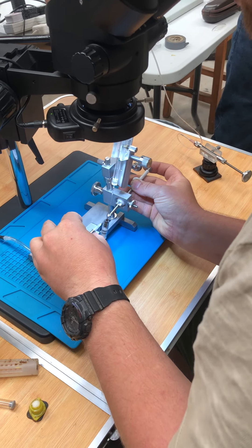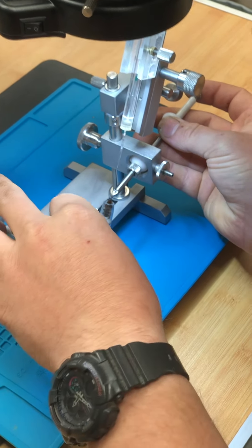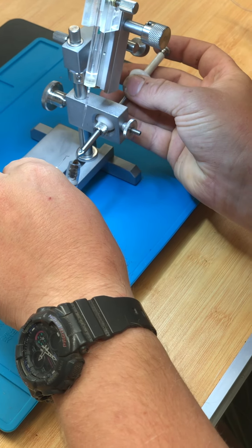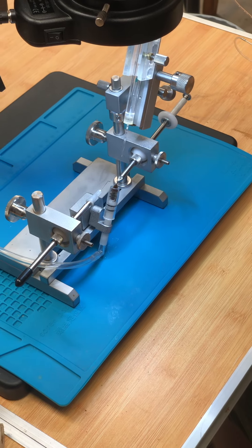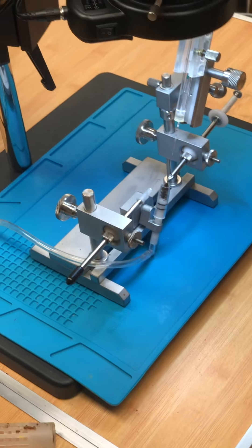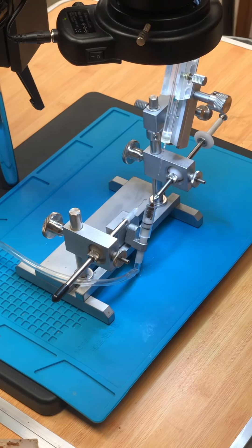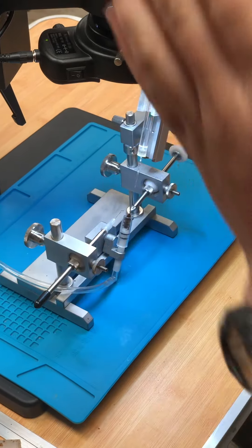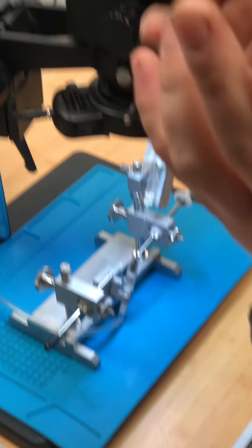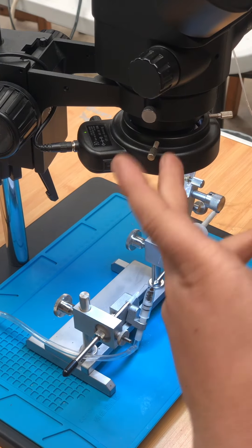Sting forceps in, and they just want to push down and take the place of the ventral hook. So all we've done now is place the sting forceps inside the abdominal opening, which is going to keep it open. The ventral hook is now out of the way, because we've got to just open her up enough so that we can actually see where the sting is and grab hold of it.